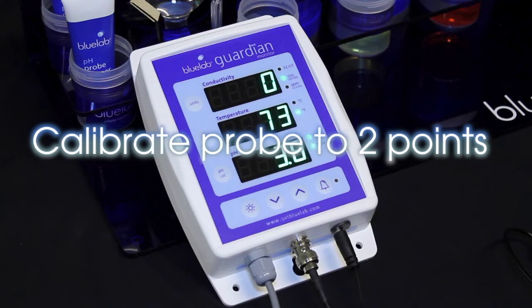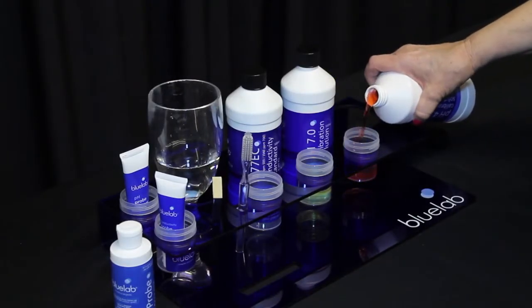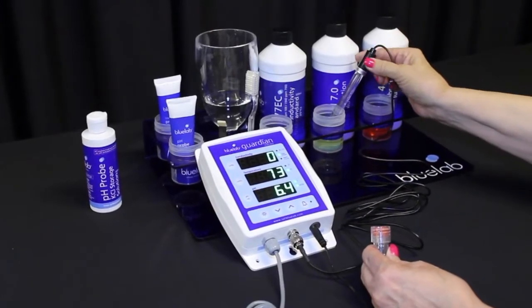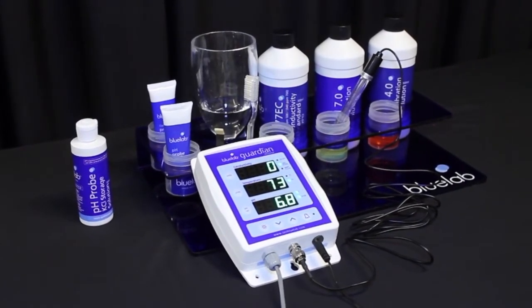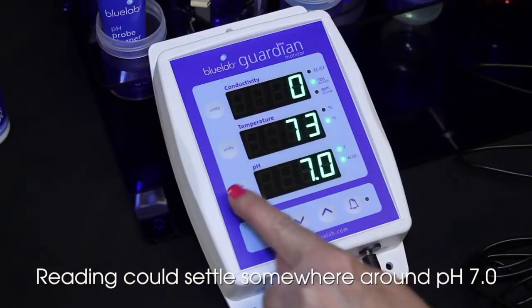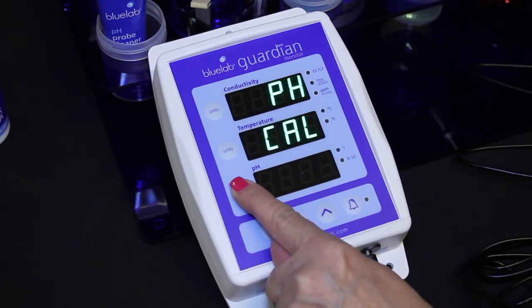Calibrate your pH probe to two points for accuracy. Use freshly poured pH 7.0 and pH 4.0 calibration solutions. Ensure the Guardian is on. Place the pH probe in pH 7.0 solution. Be sure to wait until the reading has stopped moving. Press and hold the pH cal button until the monitor shows pH and cal on the top two displays.